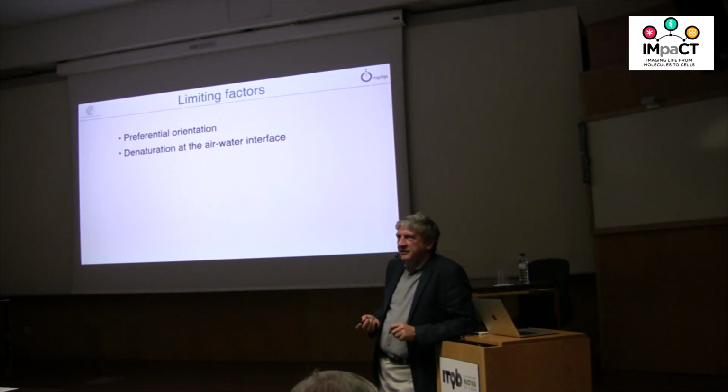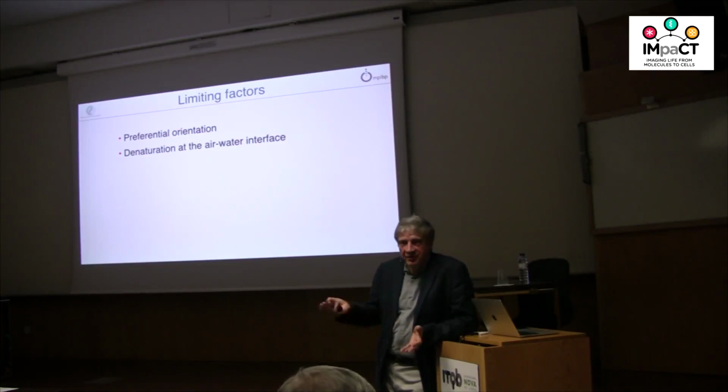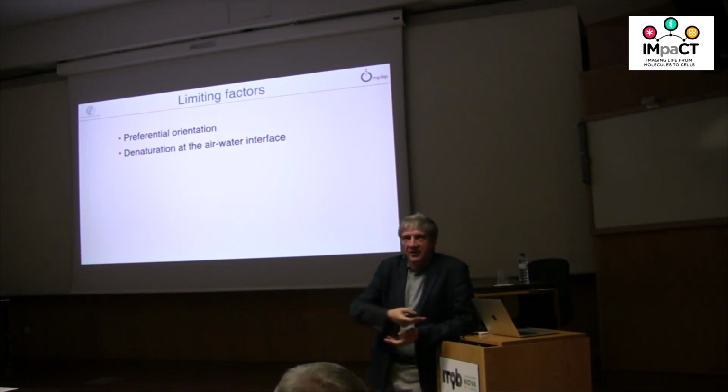Yeah, the best thing you can hope for is to make it go away. I had of course the opposite. By its very nature, that's not a standard, it's not a routine thing, because if it works in one case, it doesn't necessarily work for another. Proteins have different reasons for adhering to surfaces. And this can be quite insidious, and there's no patent method. You just have to play around and try various tricks, and quite often one will work. You can spread detergents or certain substances on the surface to make them less hostile, for instance.